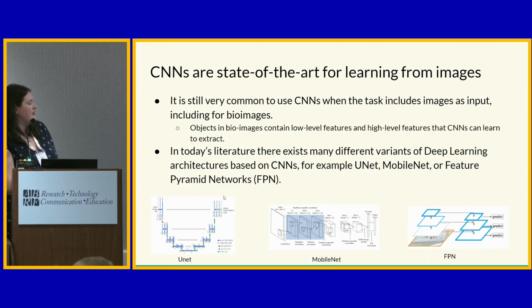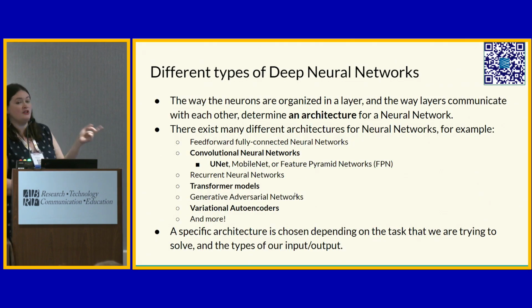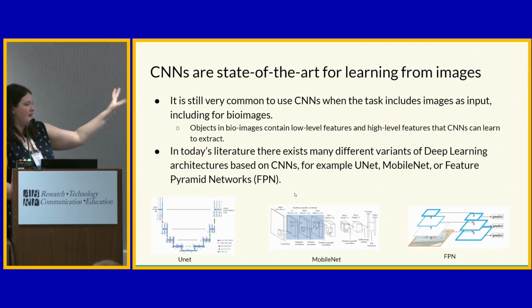In general, the way these architectures differ from one another is essentially how many of these features and neurons we have and how the connections work. You can create infinite variety by just changing the number of layers and the size of the layers. And sometimes, instead of a layer talking directly to the layer behind it, you can do things like a skip connection where it actually goes two ahead. So it's a very general purpose idea that can be molded into any shape, kind of like Lego blocks.